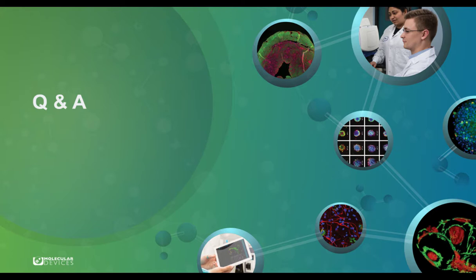I think there's a reason for that, because for those kinds of event detection, sometimes the signal amplitude is different. So for example, in the template search, we need to create our own template, right? So that's why it sounds like a good idea, but it's impractical to do in the batch analysis. That's why at this point we don't have this kind of event detection in batch analysis.